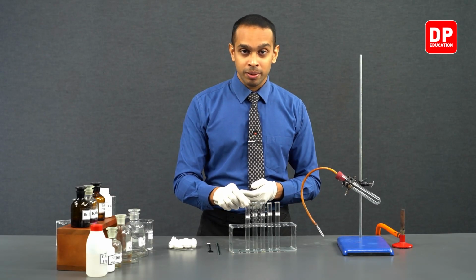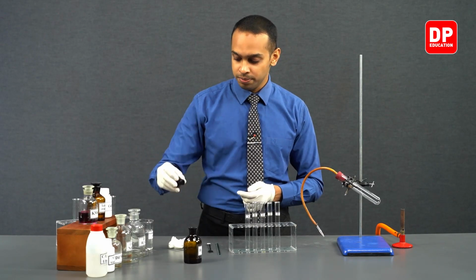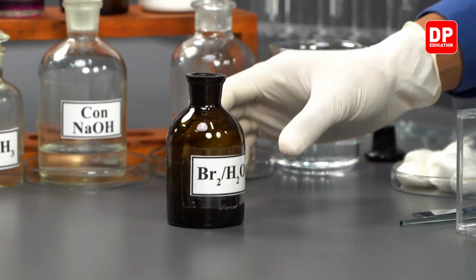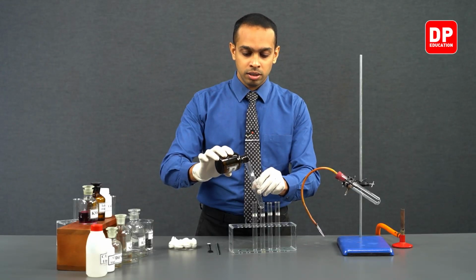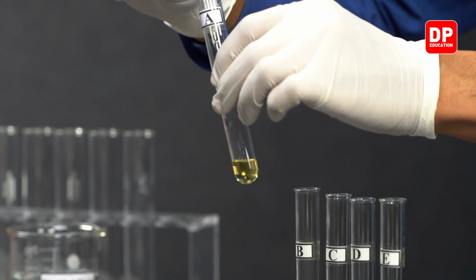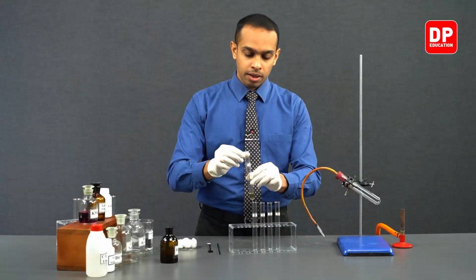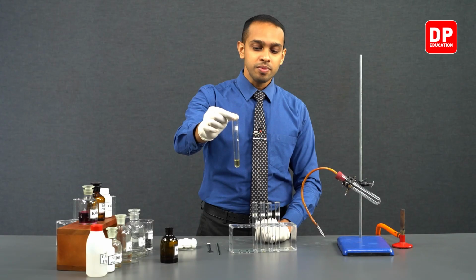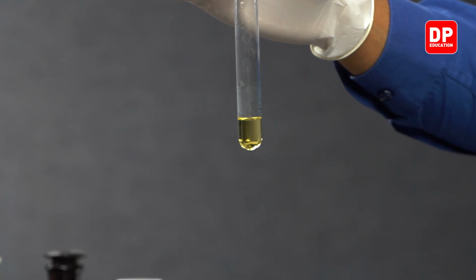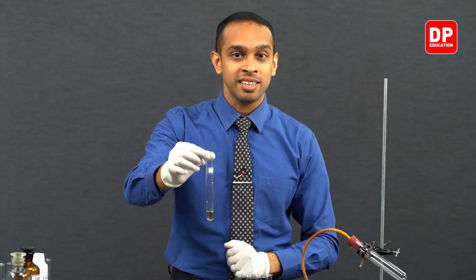For the test tube labeled A, we are going to be taking bromine water. We have bromine water here. As you can see, we are going to take a small amount of bromine water into our test tube labeled A. Bromine water has a bit of a yellowish hue to it. As you know, bromine is red-brown in color, and bromine water is going to have this color that you observe here.